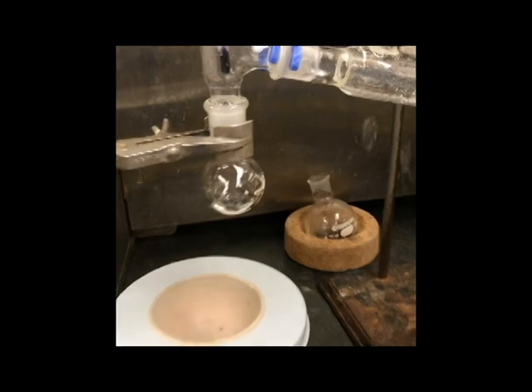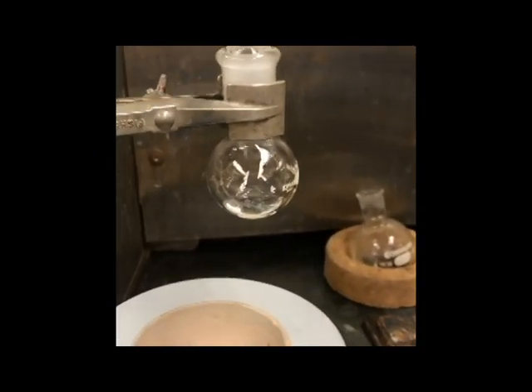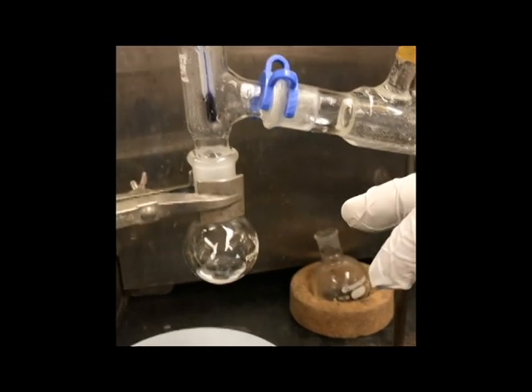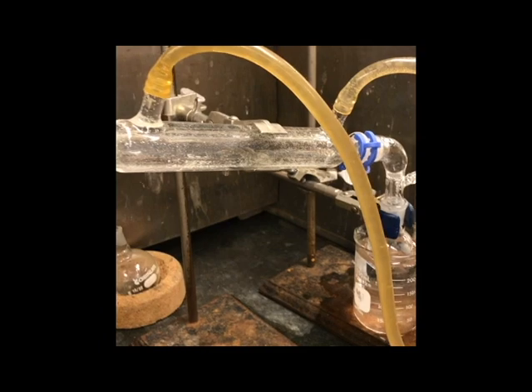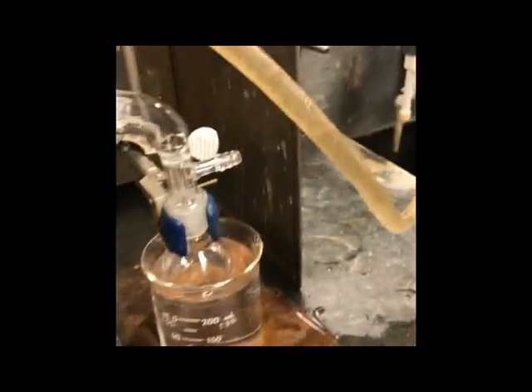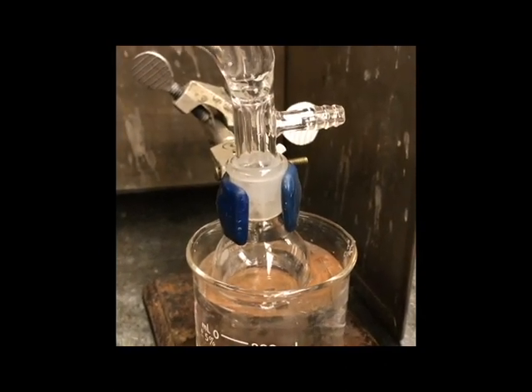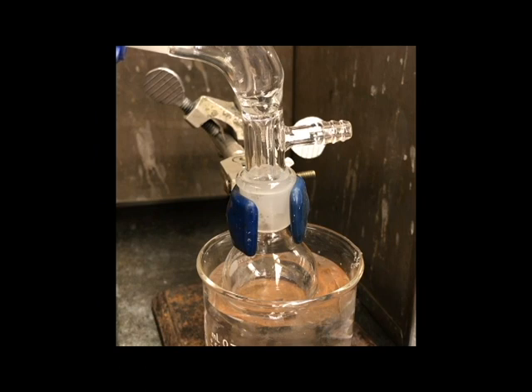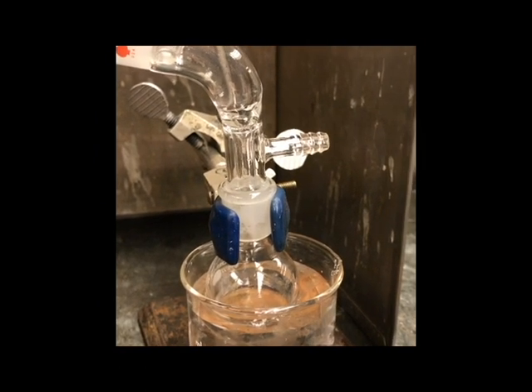So here we are at the conclusion of our second distillation. You can see here that we did not distill to dryness. There's still some remaining liquid in the reaction flask. Our temperature varied from 78 to 87 degrees Celsius. Over here you can see our purified reaction mixture, still being cooled in an ice bath to limit evaporation loss. So now that we have completed this step, we're going to move on to our characterization tests.